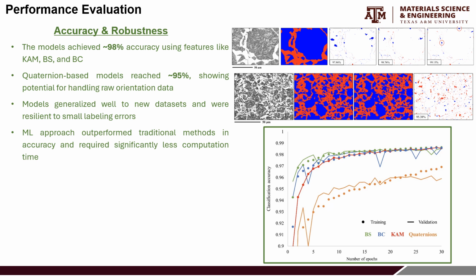And at 25 epochs, the training classification accuracy of the quaternions showed an upward trend, while the validation remained fairly constant. So this indicates overfitting. This is the reason why the model was trained until 25 epochs, which was selected to be the final threshold. Approximately 700 seconds were needed for each epoch to complete, and it resulted in higher accuracy.